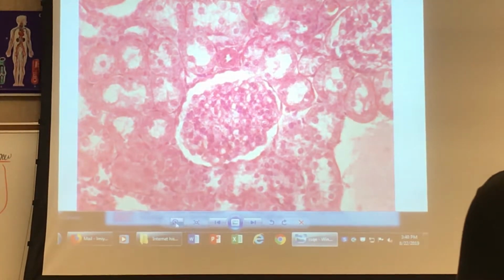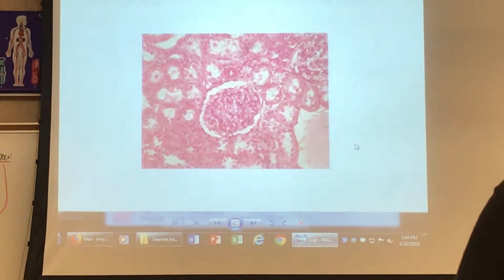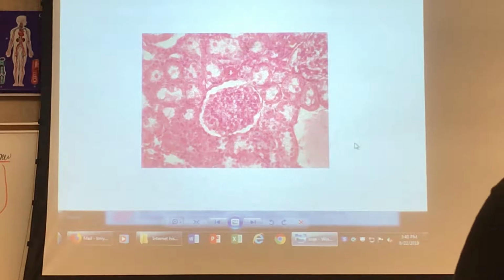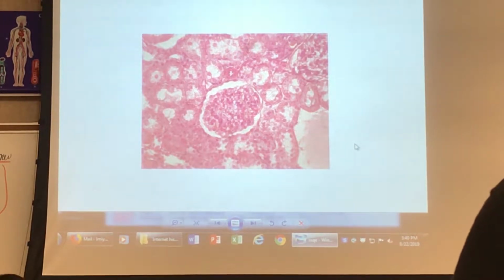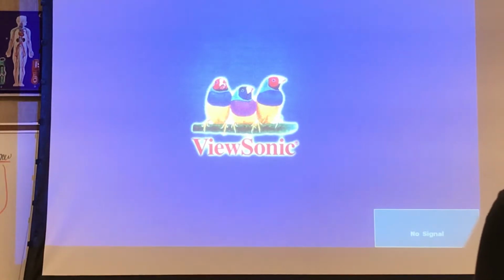I can get more resolution if I shrink it, but it's still hard to see. Don't worry, for the lab quiz, there'll be better slides. No complaining.